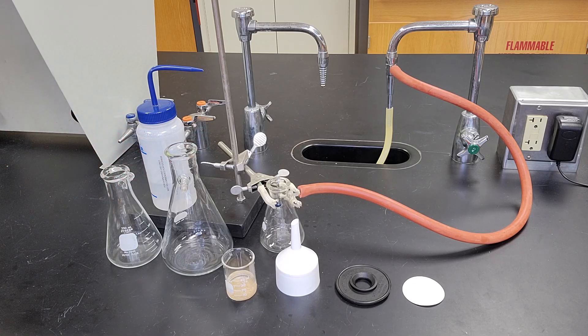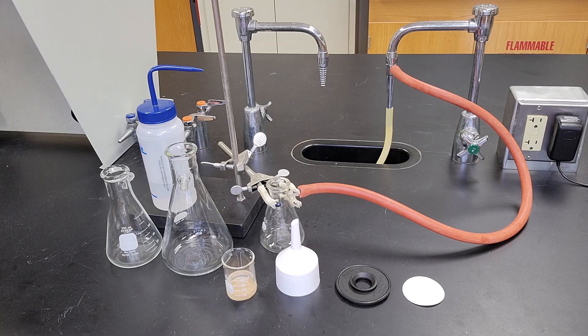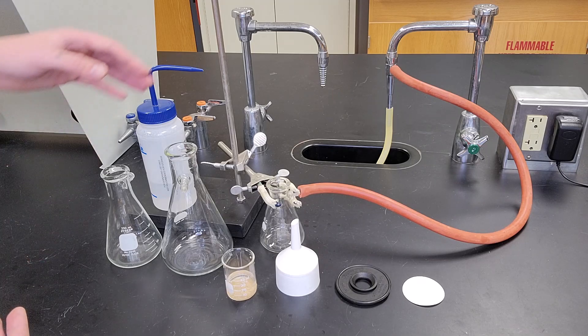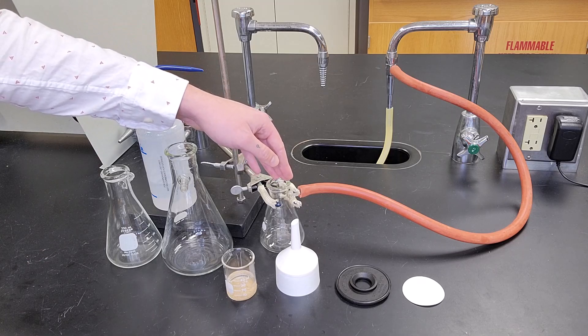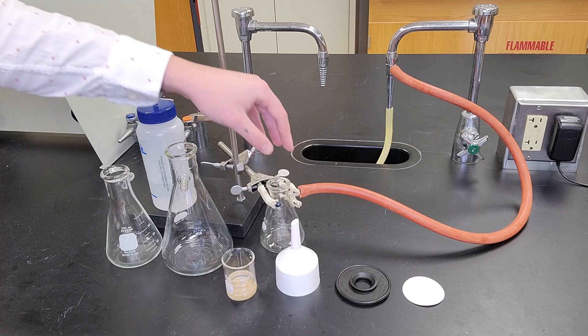You would choose the sidearm flask that corresponds to the volume of liquid you're expecting to drain through. So if you're expecting maybe 50 mils of liquid to come through your filter, you might want to choose the smaller one.